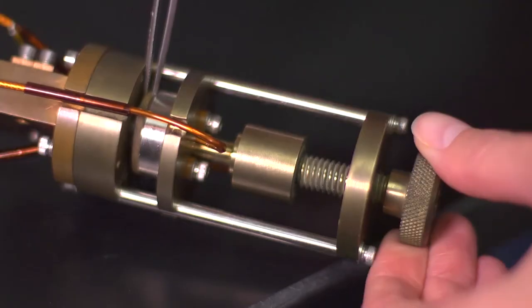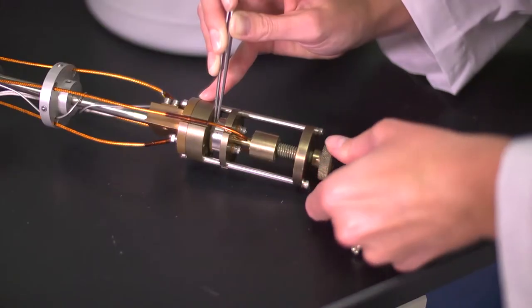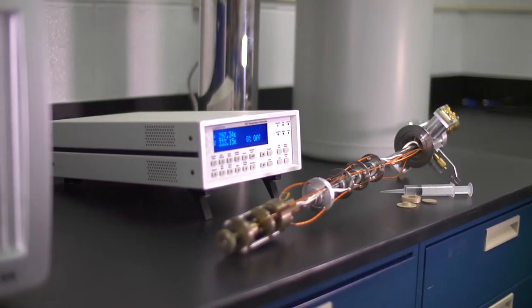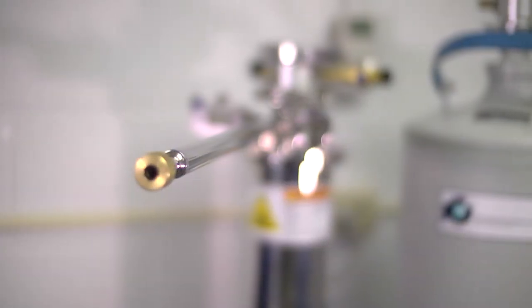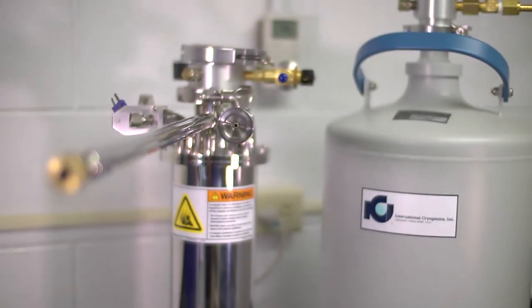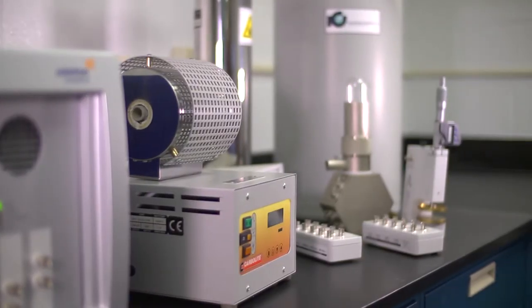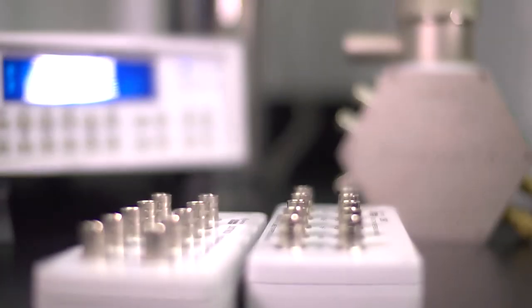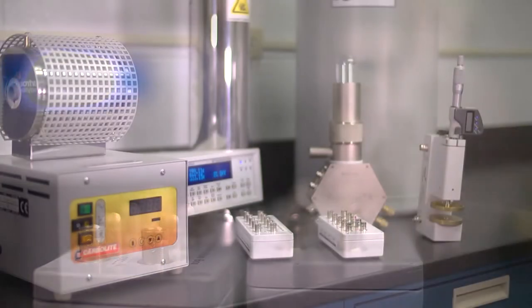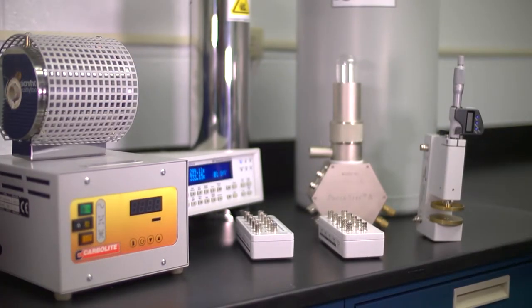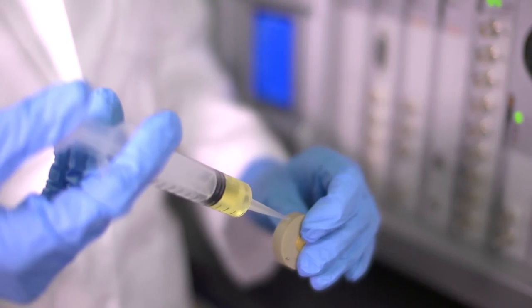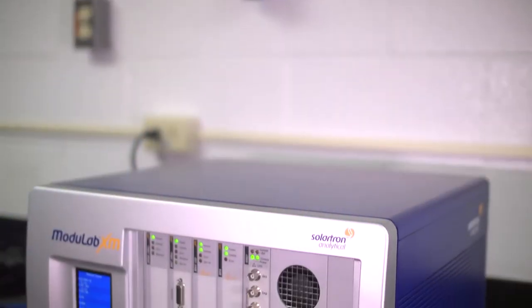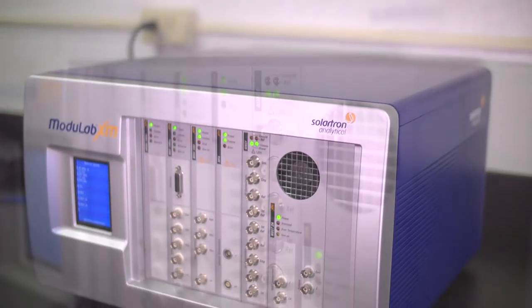Modulab XM-MTS can be configured with a wide range of environmental test packages, including cryostat and furnace systems. Based on your application profile, Solartron can provide a customized test solution configured to your exact needs and specifications. This turnkey system provides the materials researcher with a fully automated system with installation, training and support included.